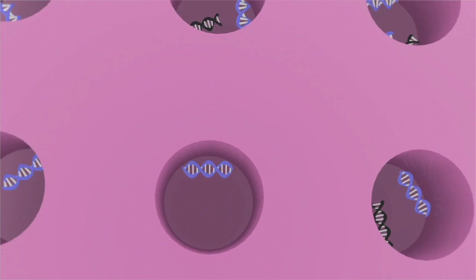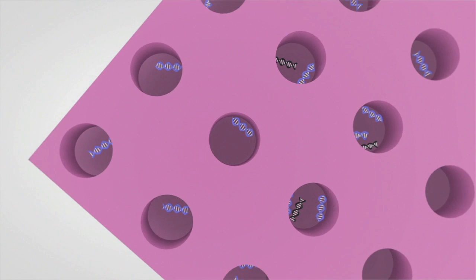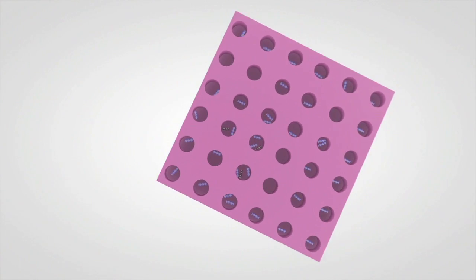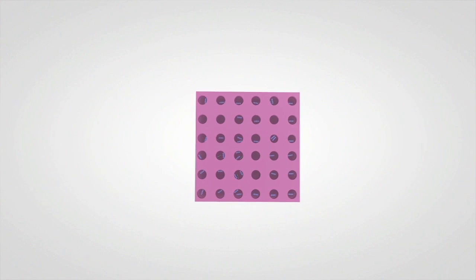Digital PCR starts with the partitioning of your reaction mix into hundreds to thousands of independent PCR replicants. Some partitions receive the nucleic acid sequence of interest, and others do not. Partitions with a target molecule will amplify via PCR to a detectable level. These are categorized as positive reactions.